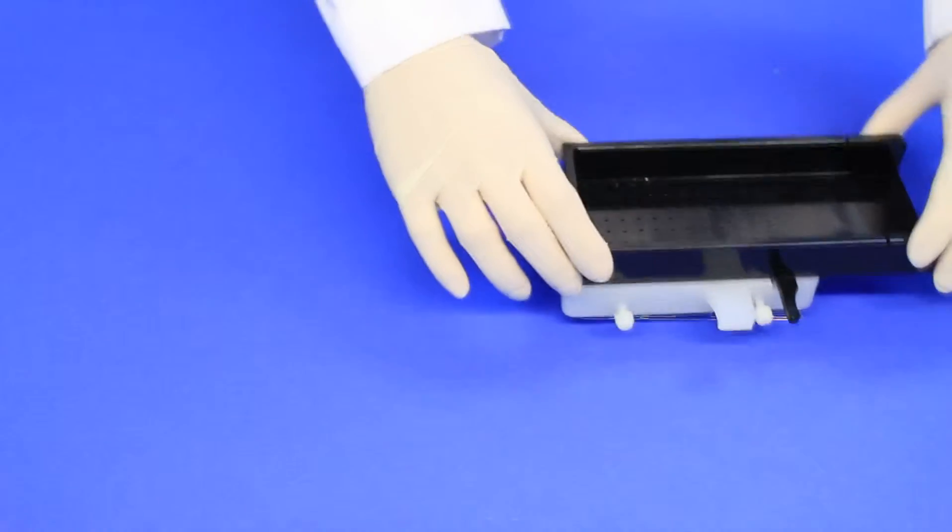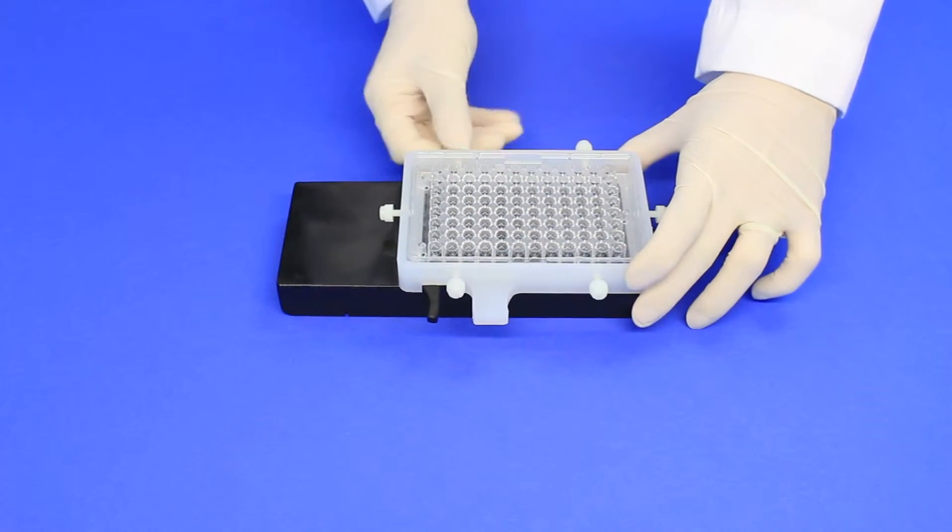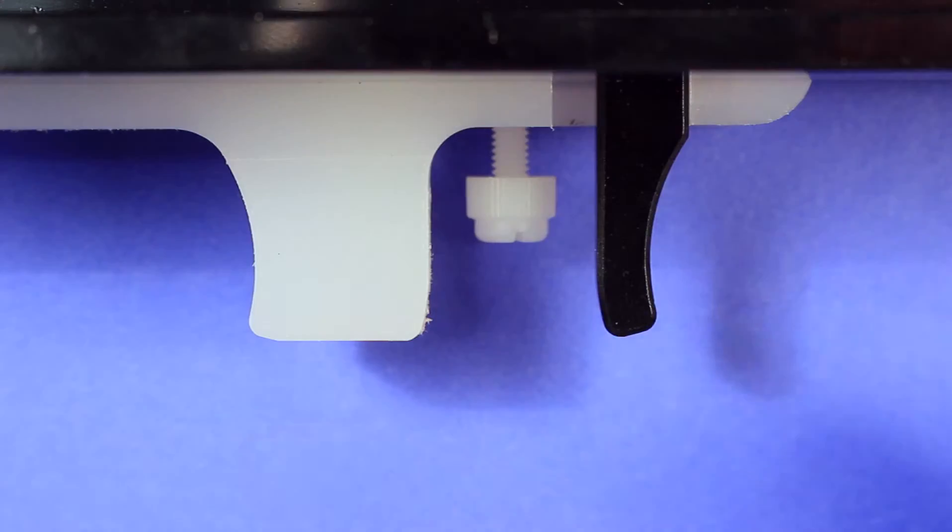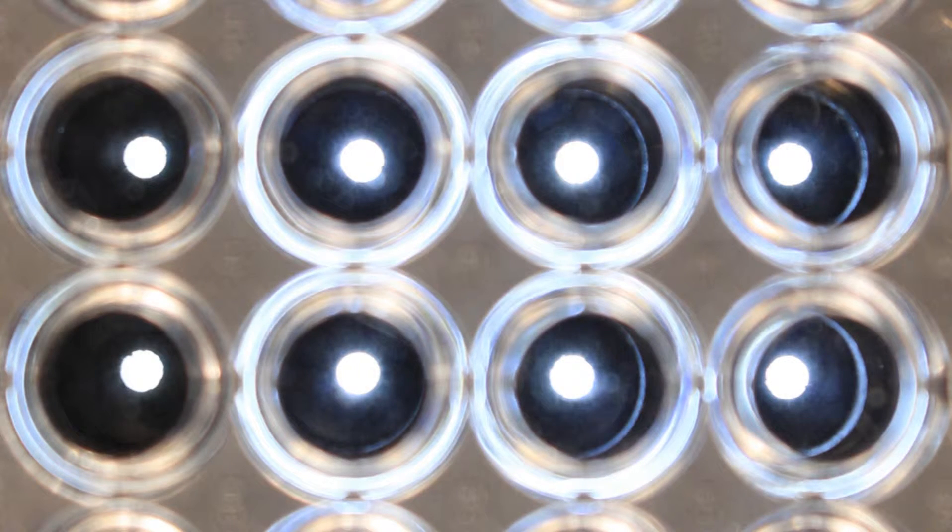If needed, register your microplate to the dispenser using the thumb screws on the dispenser. Hold down the release bar and make sure the holes are centered in each well of your microplate. Readjust if needed.